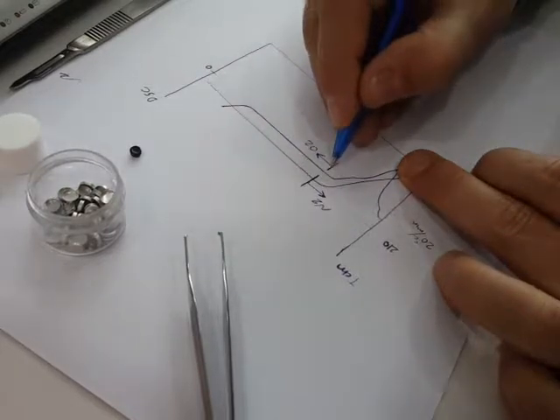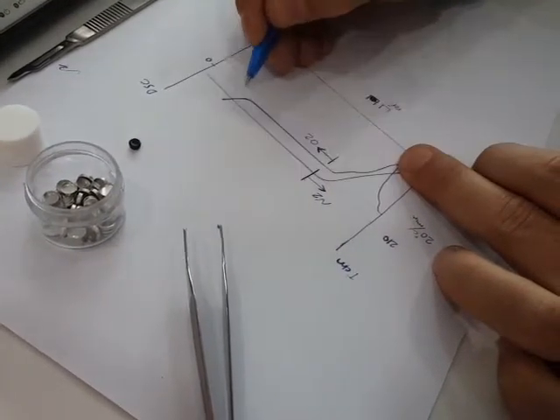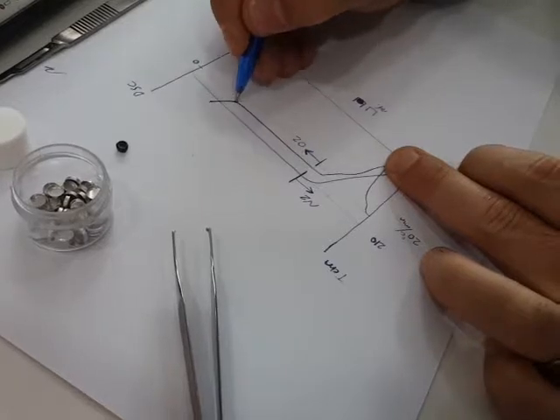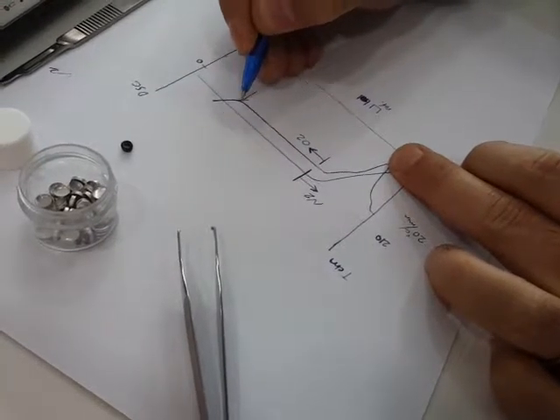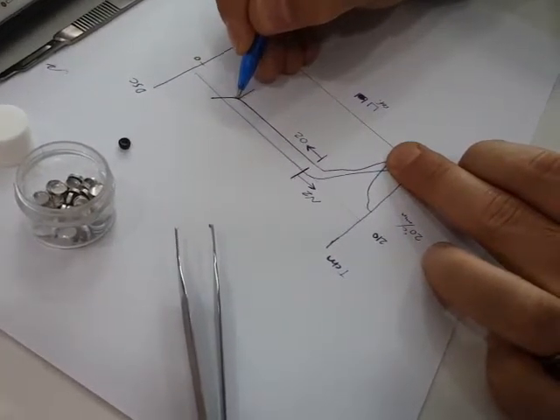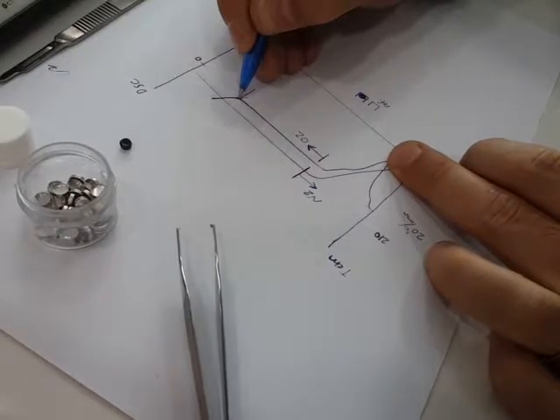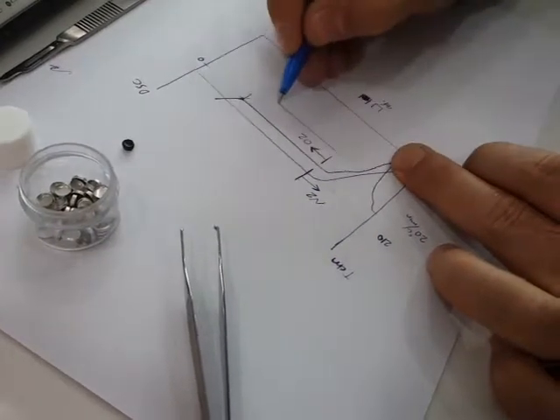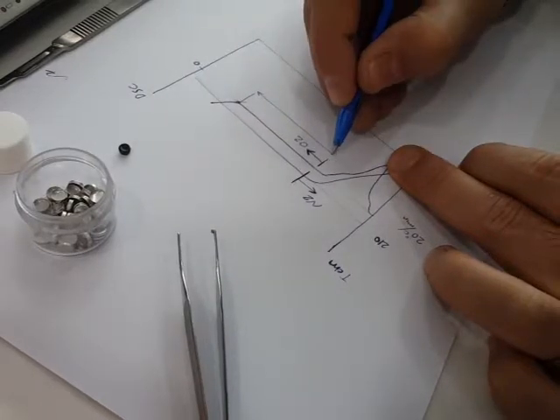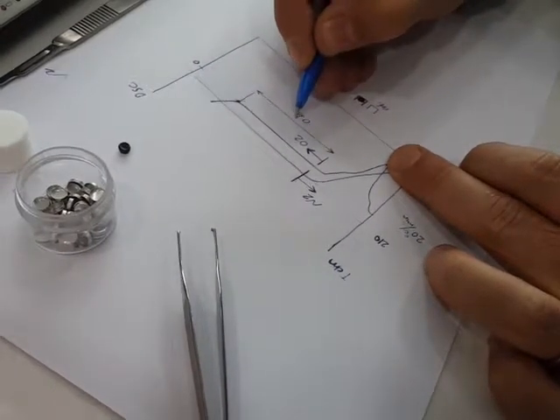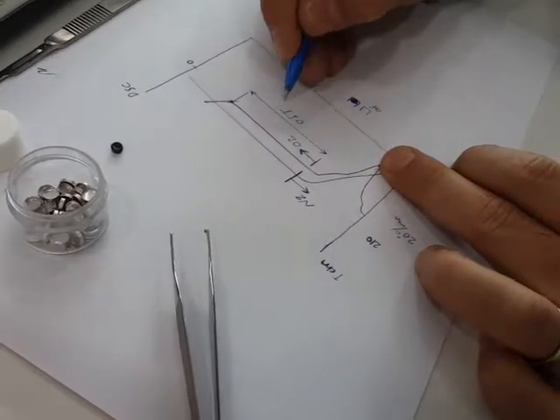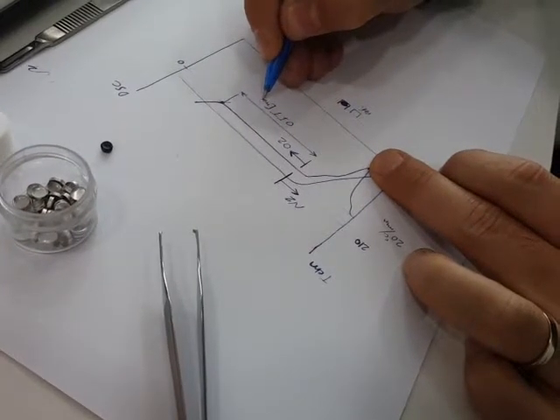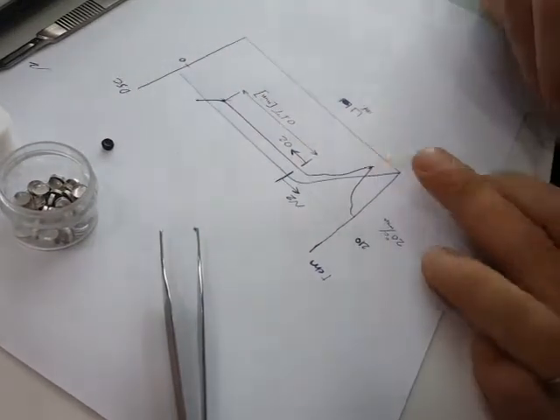From the oxygen opened till this time, the onset point of the break of the DSC graph will be the OIT value of the sample. It will be shown in minutes.